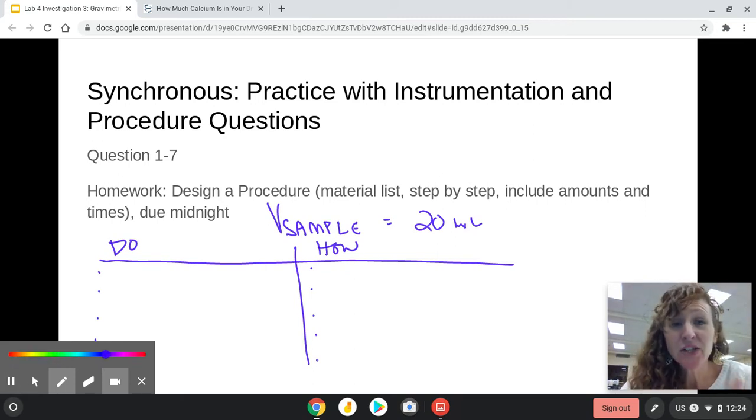Okay, welcome back. So one of the important questions you should have thought about is how much sodium carbonate are you going to add to your water in order to get all of this calcium to precipitate out. So there's a couple different ways you can approach this. First of all, you could try a visual approach where you pour the two solutions together and see if much more precipitate forms. Now, that is a tricky way to do it because you're relying on your visual ability and you're forming a cloud at the same time. So it's probably not the most reliable approach.